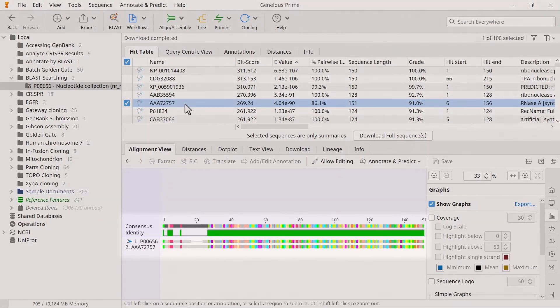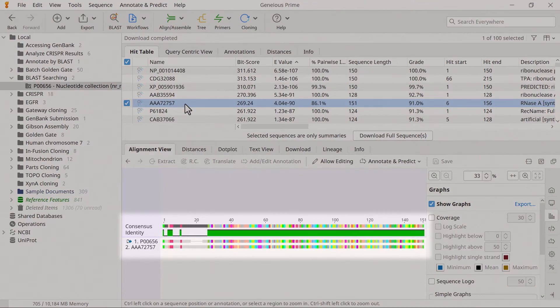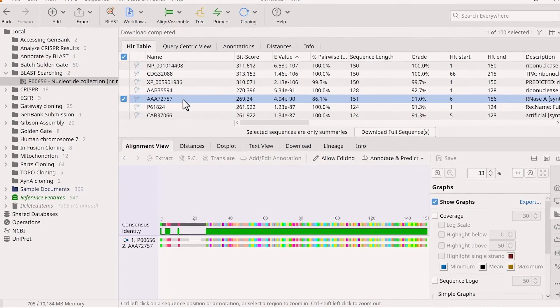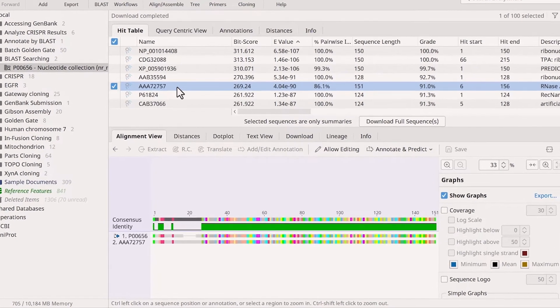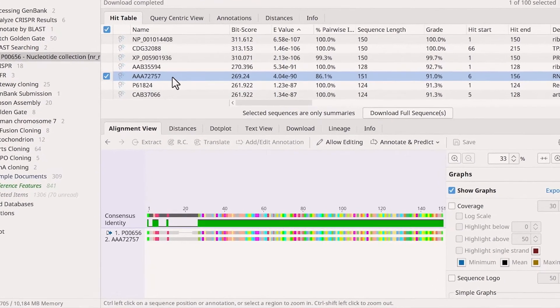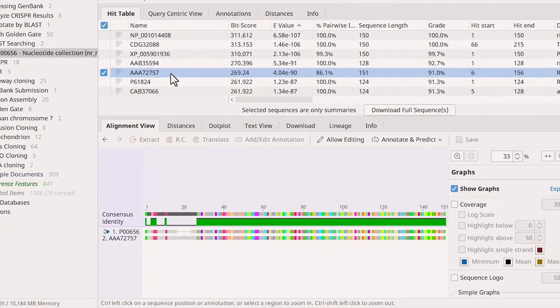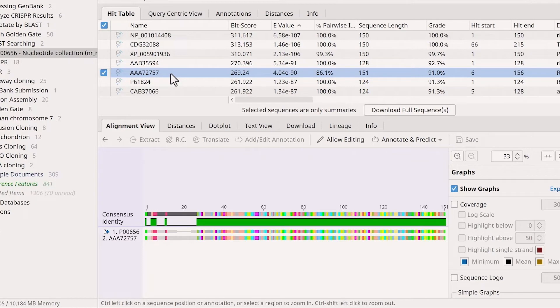The consensus identity bar displays the similarity between the sequences. The green regions of the bar indicate matching regions, while gaps in the bar indicate that the sequences differ at that point.